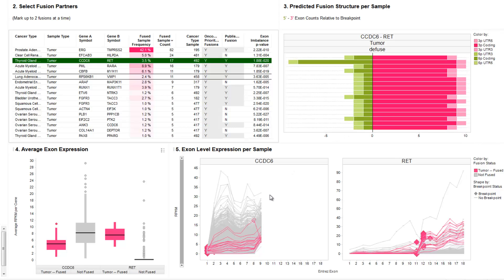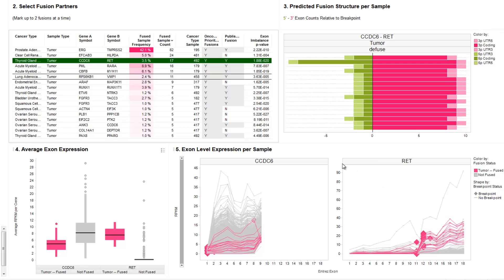Below, we're showing each of the pairs and their RNA-seq data or expression data from next-gen sequencing data as RPKMs. And post-break point, as indicated by the red triangle, we see a shift or an increase in expression of RET fused with CCDC6. These are potential fusions that are supported now by exon expression imbalance of one of the partners in this fusion. This is supporting information that may indicate a potential role in disease for this particular fusion.